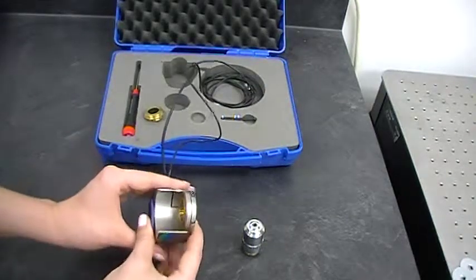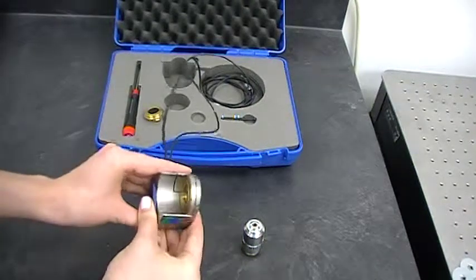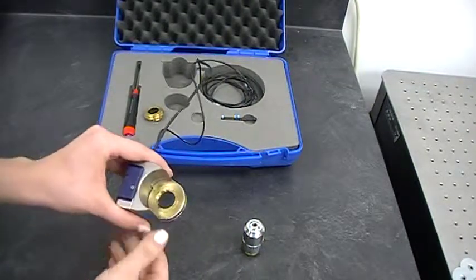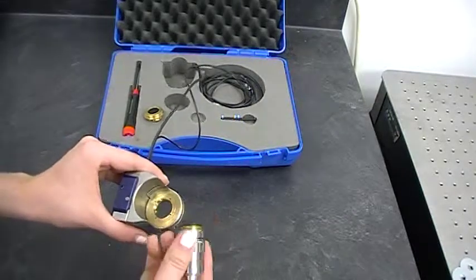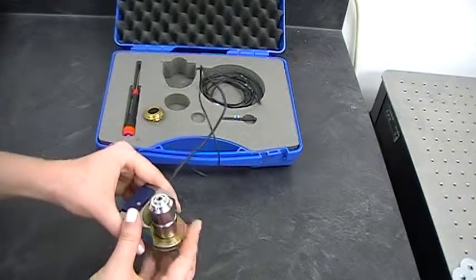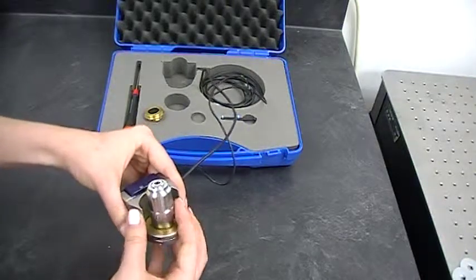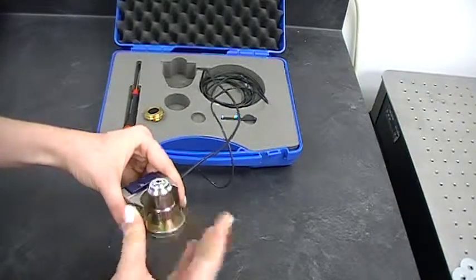I don't know if you can see, but it's pretty low profile — it just doesn't add anything, really. So now we're ready to put our objective in, and this also just screws right into the threading. There you go.